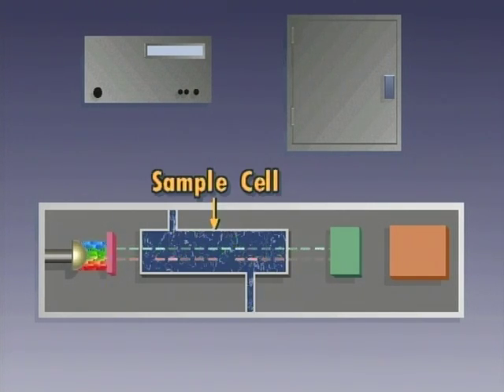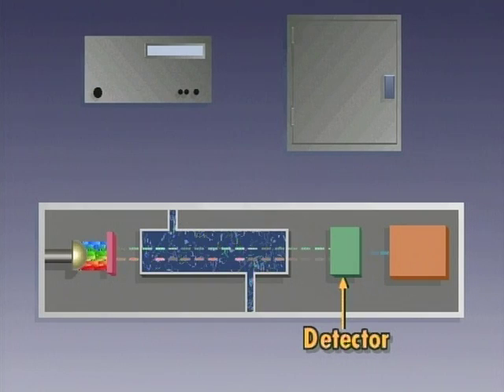As a conditioned process sample flows through the sample cell, it enters the optical path, where it absorbs a specific amount of the measurement wavelength based on the sample's molecular structure. The detector senses the amount of measurement wavelength radiation not absorbed by the process sample. It then compares the reference and measurement wavelengths to identify the sample. The detector transduces the results of this comparison into an electrical signal.